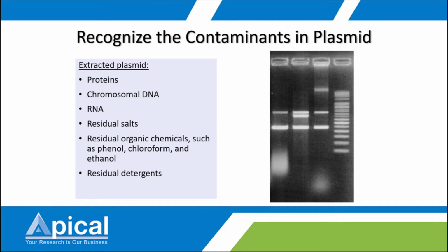That all refers to the handling of the plasmid extraction itself. Some contaminants are also organic chemicals like phenol chloroform if you are using a conventional method to extract, or detergent.